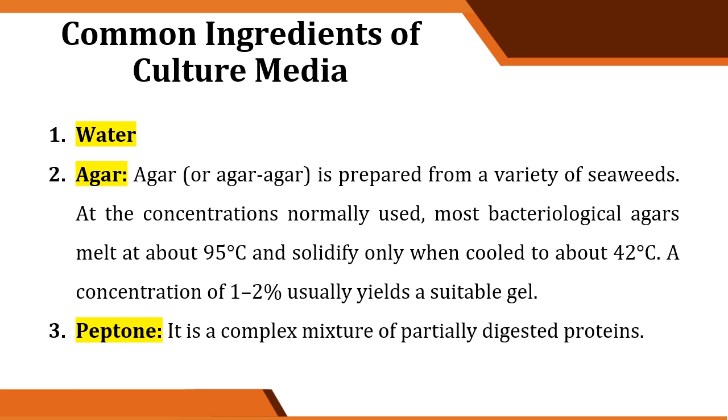Next is peptone. Peptone is a complex mixture of partially digested proteins. From number 3 up to the next slides, those are the specific ones. Not all culture media have those components. Okay?